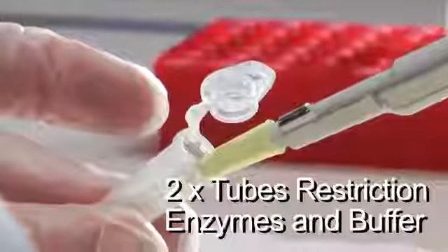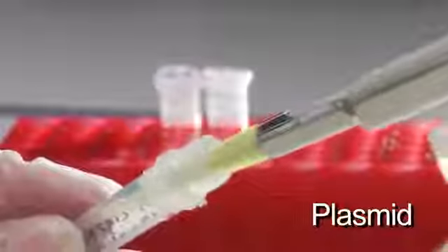Restriction enzymes are naturally used by bacteria to cut up any invading DNA, but we're going to hijack them and use them for science. To start the process, I have to prepare 2 tubes of restriction enzyme and buffer. I take a sample of some plasmid and I add it to the first tube.